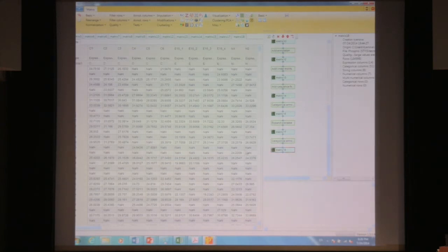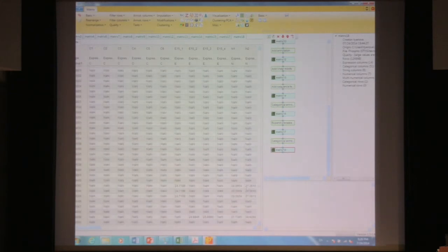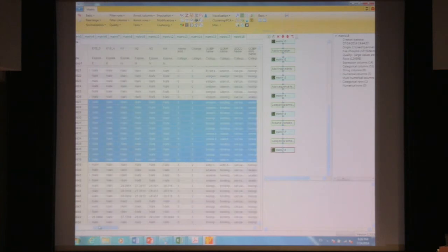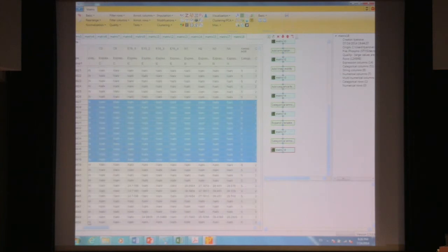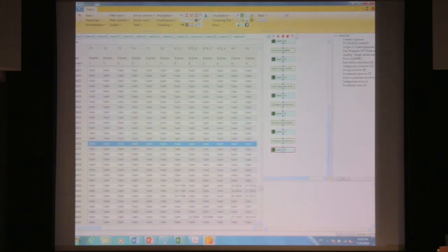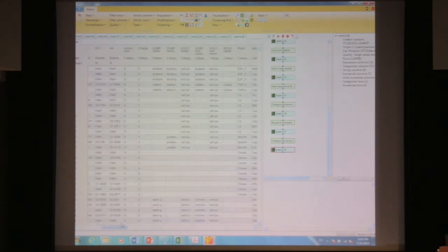But as a result, we will have many rows which contain no values at all, because we don't have singly or triply phosphopeptides for a lot of the sites. I'll just show you where they are.